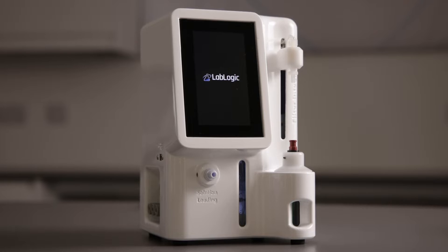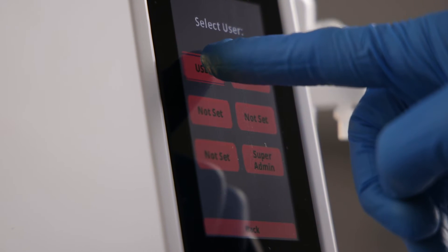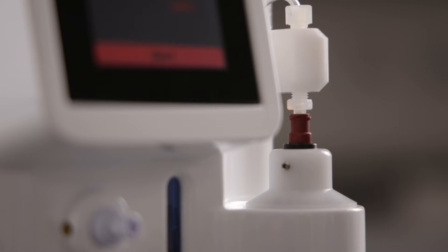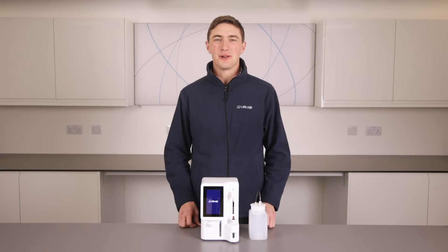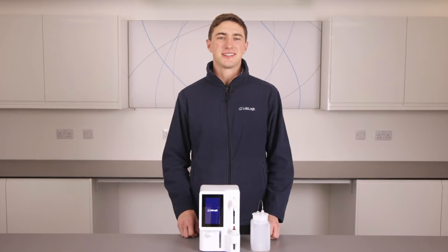The unit is a fully automated benchtop system that tests the patency of syringe filters used in radiopharmaceutical labs and in pharmacy labs alike. This unit has the ability to perform both a pressure hold test at 80% of the bubble point and the bubble point test.